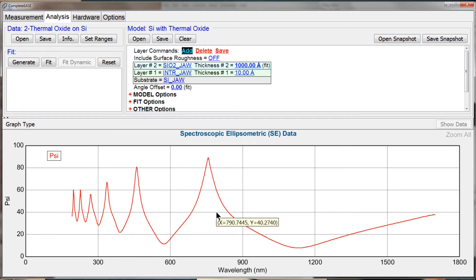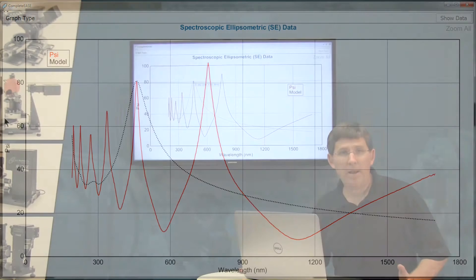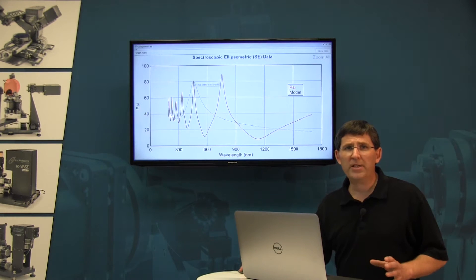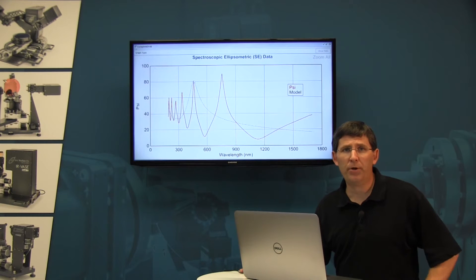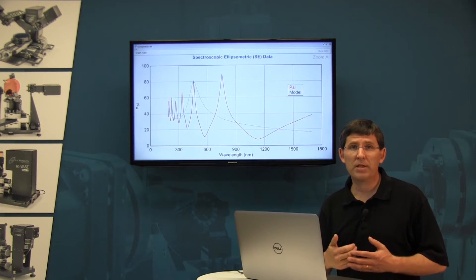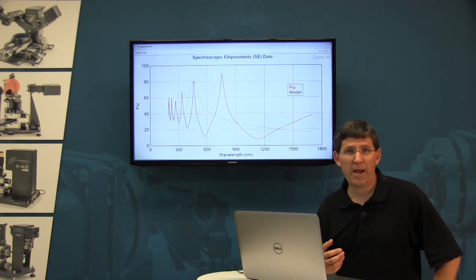Now again it has a thousand angstroms as my starting thickness, but when I generate I notice that that thickness is wrong. And I know that because in order for the thickness to be correct it has to reproduce the shape of my data, which means it has to have the same numbers of peaks and valleys as my experimental data.